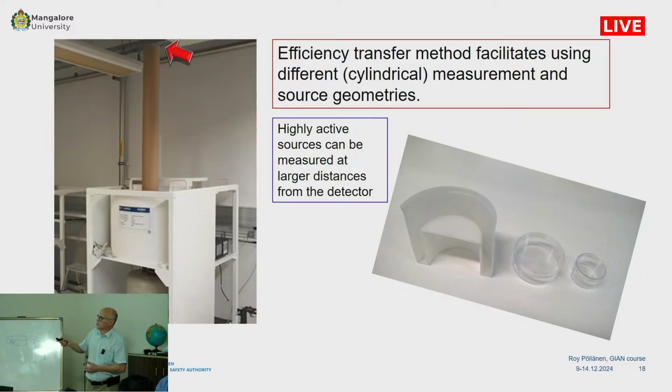This is a plutonium source, but the point is that this plutonium nuclide, you can check this in the LARA application, doesn't emit many gammas. So we wanted to qualify this source, what kind of source it was. It was used in some studies on biological things, how alpha particles react with cells of your body. But let's neglect that.